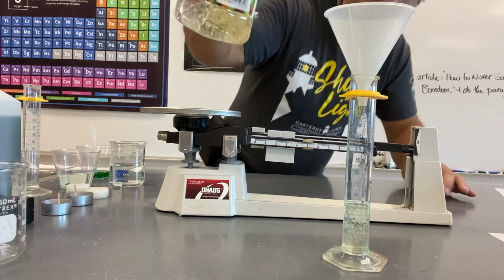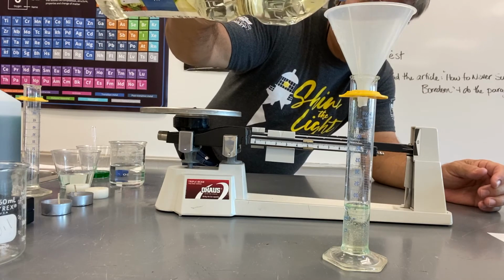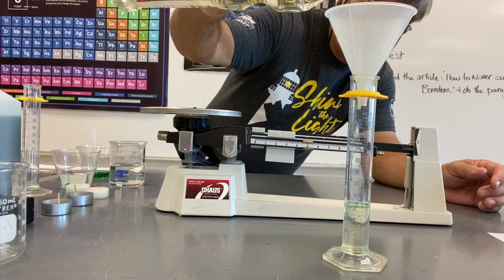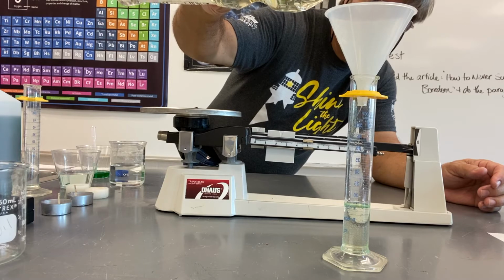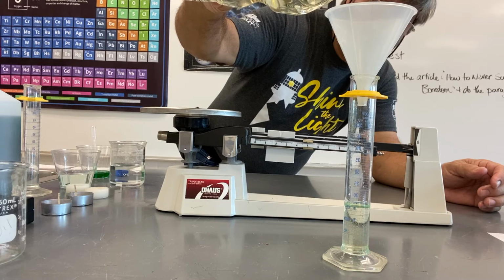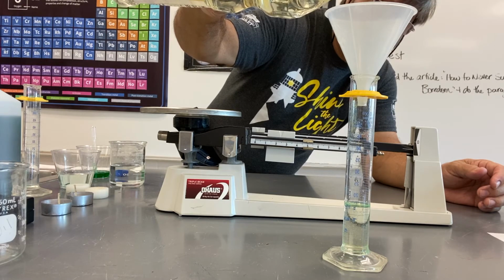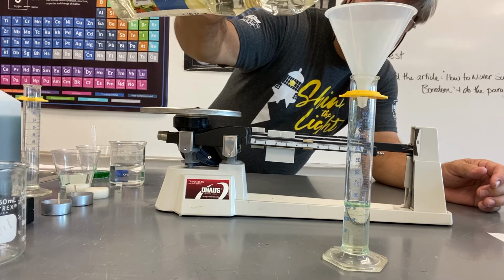And I'm not wanting to put the transfer pipette into this stuff because I'll never get it out of there. So I'm going to try really hard to go a drop at a time here and get us up to the 20. More time ought to do it.